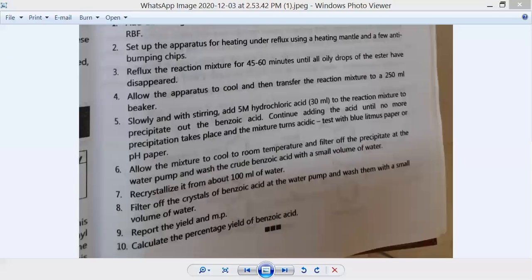सो यू कॅन टेक एनी क्वांटिटी बट इट इज नियरर अबाउट दॅट. म्हणजे एक दोन सपोज 1 to 1.5 चा फरक असला पाहिजे. सपोज यांचं मॉलिक्युलर वेट तुमचं 6 ग्रॅम आलं तर तुमचं प्रॅक्टिकली ऍटलीस्ट 4.5, 4.6 किंवा 5 ग्रॅम, जास्तीत जास्त 1 to 1.5 चा फरक असला पाहिजे, त्याच्यापेक्षा जास्त नाही. ह्या पद्धतीने तुम्ही तुमचं प्रॅक्टिकली कन्सिडर करायचं, कारण आता तुम्ही ऍक्च्युअल एक्सपेरिमेंट करत नाही.